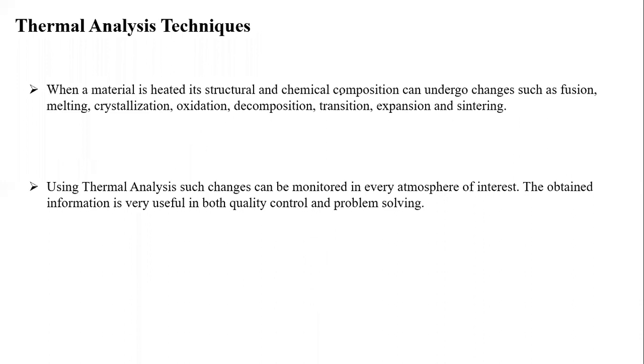Very first, students, we will see differential thermal analysis. It's a destructive analysis, students. Differential thermal analysis is a completely destructive analysis. Destructive analysis means we can't use the sample again. Once we use the sample, we have to destroy that sample. We can't reuse the sample again, which is quite the opposite of X-ray diffraction.